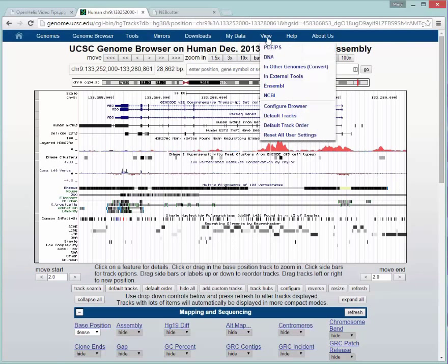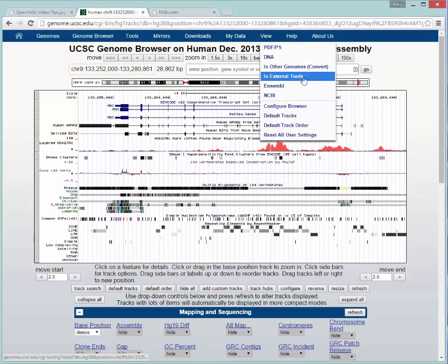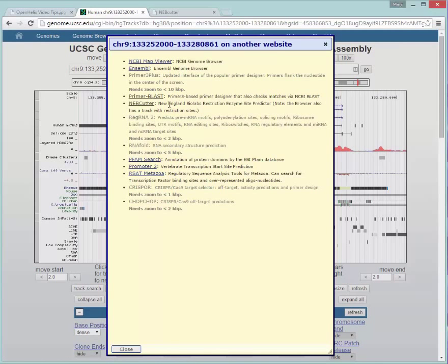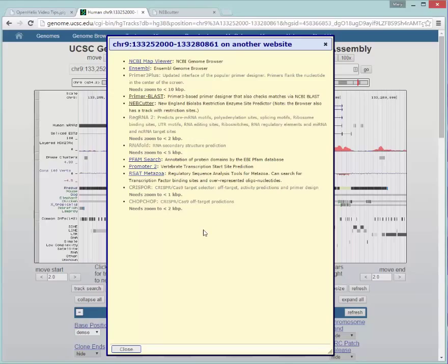As you can see, there are other tools available as well. I won't go through them all, but here now you can see how you can access these external tools right from the graphical interface that we were looking at. So you can take sequences right from the graphical interface and now you can send them over to these other tools.